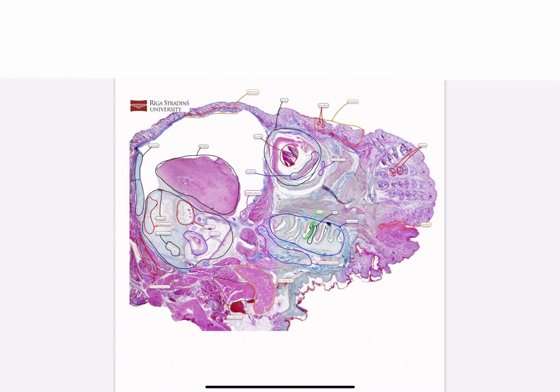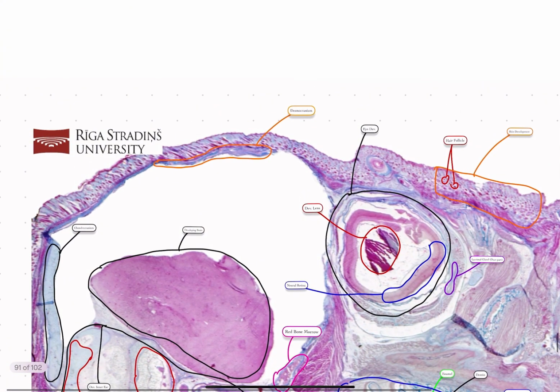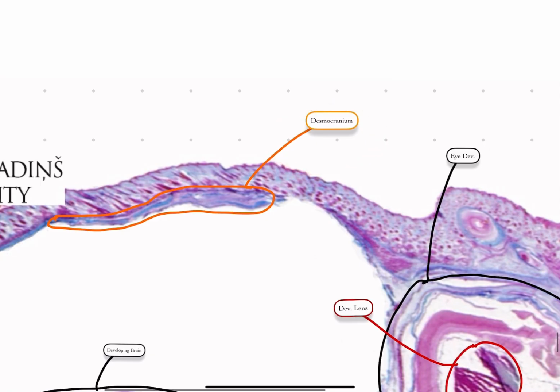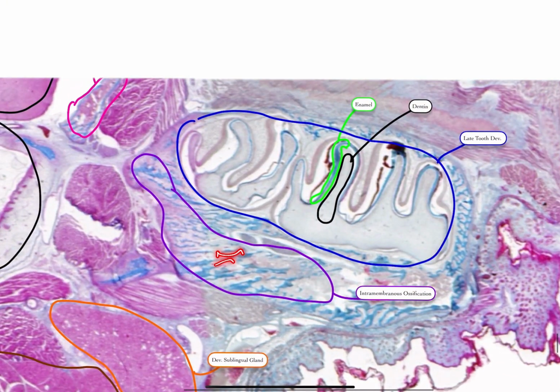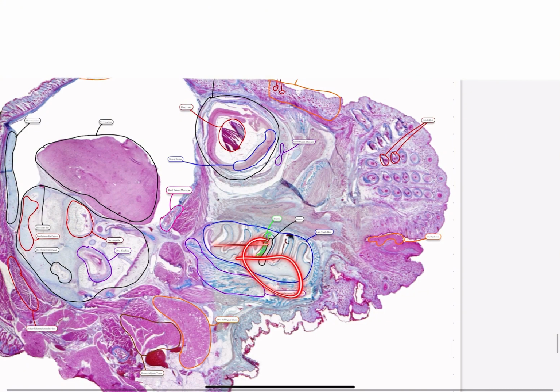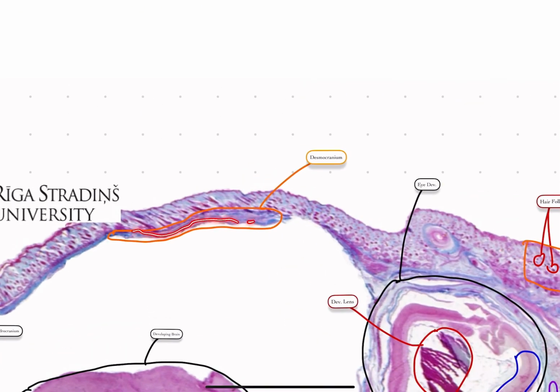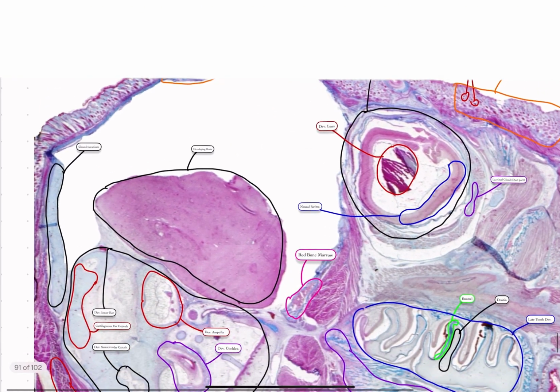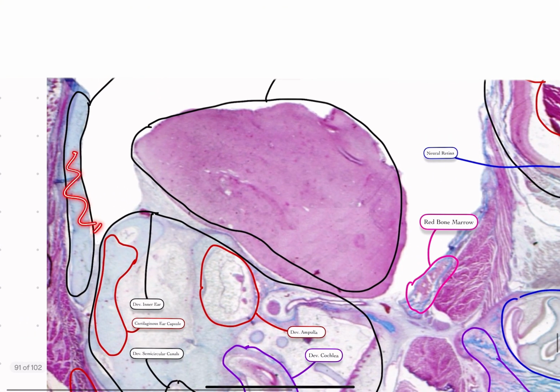But to make it more apparent for the different types of skull sections, here we have the desmocranium. In this case, it's blue because we're using a specific dye that dyes this specific material blue. We can also see the intramembranous ossification in blue. You can kind of compare the intramembranous ossification shape and appearance with the desmocranium, only the desmocranium has one line like so. While the chondrocranium, like I said, appears very hyaline cartilage-like and is a lot thicker.